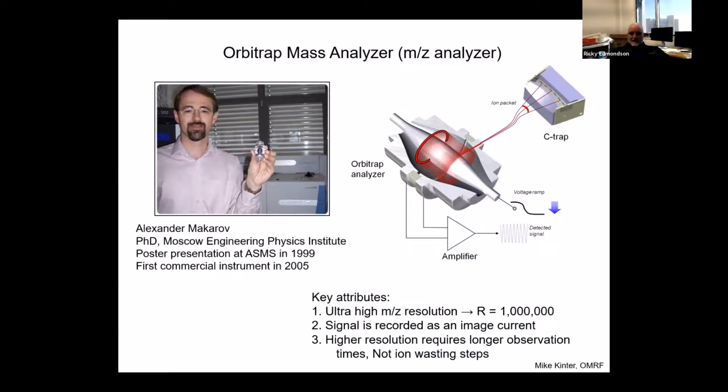The nice thing about anything analytical where you're measuring frequency is you can measure it very precisely, because you get a chance to look at it over a long period of time. And because of this precision, you can then get good accuracy. So you can get high resolution, high accurate mass, and the sensitivity is really good.